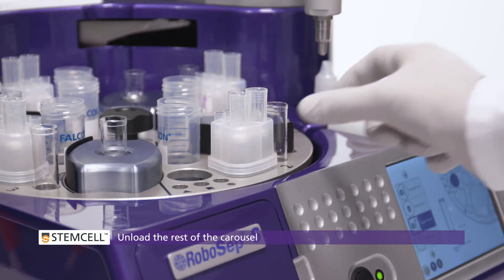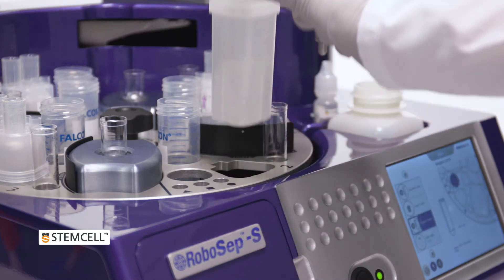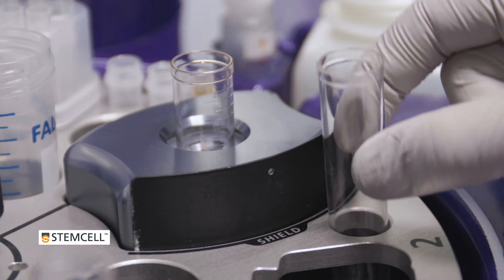Next, unload the rest of the carousel and store the reagents appropriately. Discard the used RoboCEP filter tip, any waste, and remaining tubes.